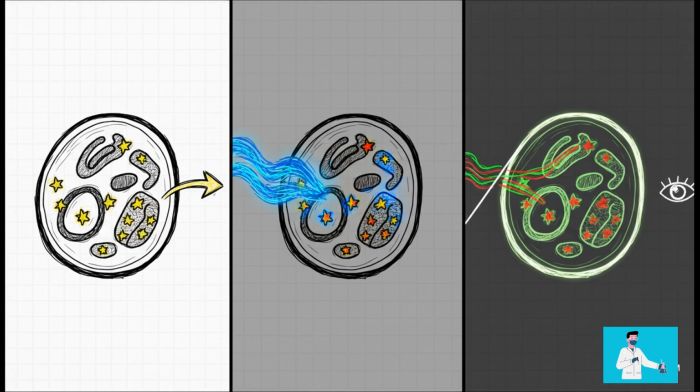The microscope then uses filters to shine only the exact color of light needed to turn on those beacons. A special mirror reflects that light onto the sample, and then only the glowing light from those tagged molecules passes back through for you to see. You're literally painting parts of the cell with light to track where they go and what they do.